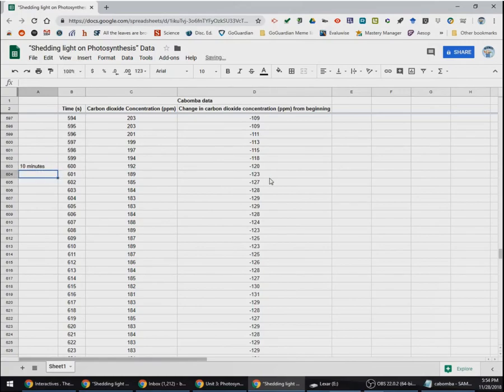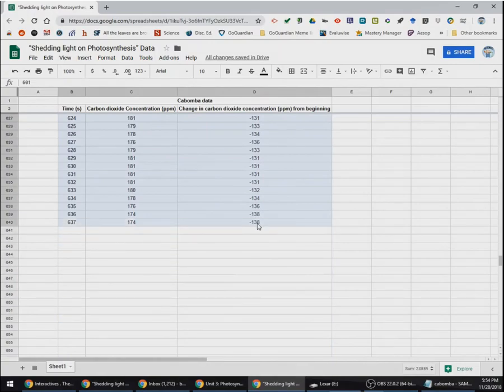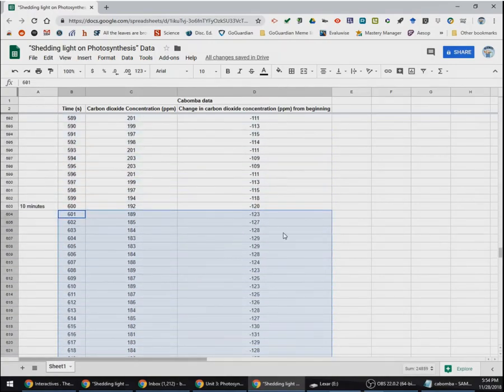10 minutes. So just like an FYI, that means that we don't necessarily need to include this extra data. We can, but we don't need to. Okay? That's your choice. What I would do then is I would select my data and I would look at this.